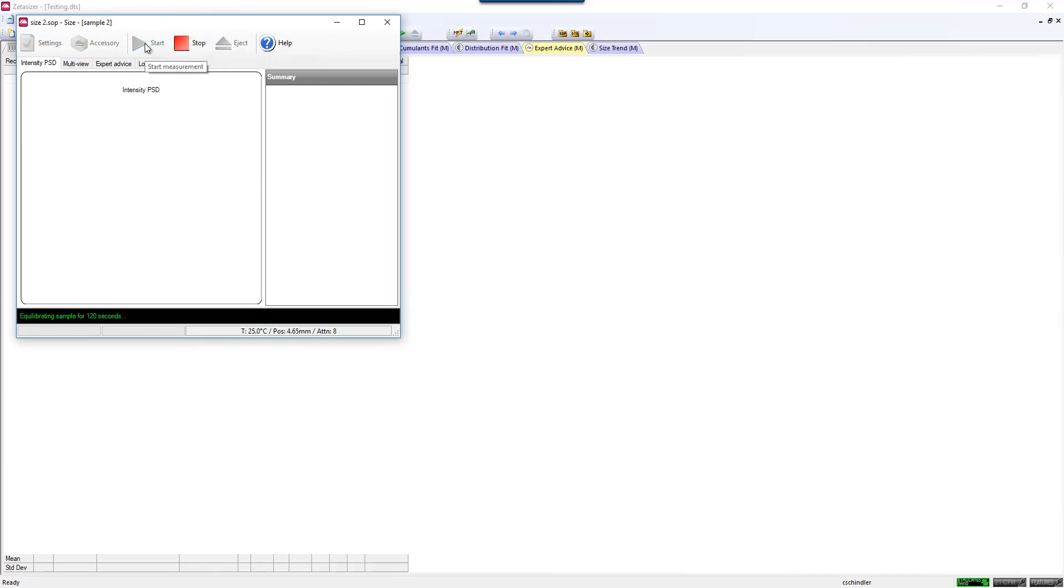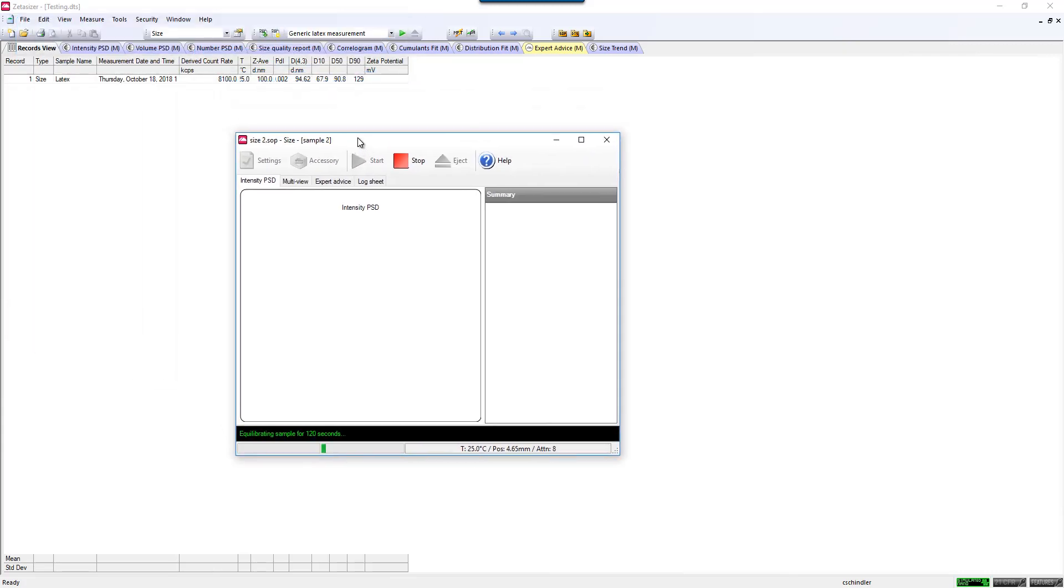And your SOP will run. Once the SOP is complete, you will be able to see the size measurement located in your record view. If you would like to watch what happens during the course of the measurement, you can note the green text at the bottom is telling you exactly where you are in your SOP.